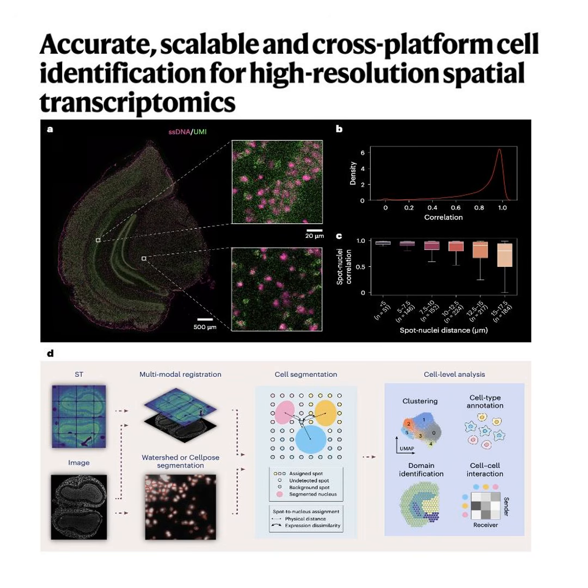When you clear a computational bottleneck like that, you can move directly into complex clinical applications, which is exactly what they did next. Let's take it to the clinic. They looked at non-small cell lung cancer, specifically patients post-neoadjuvant immunotherapy. Right. They wanted to understand the tumor microenvironment. Why do some patients respond beautifully to immune stimulants while others see zero effect?